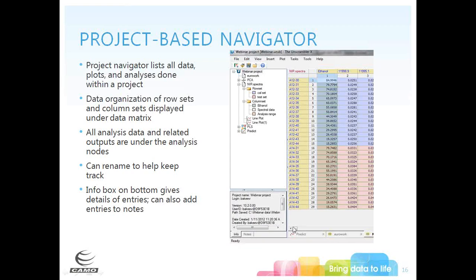There is an info box at the bottom of the navigator window, which shows the details of whatever item is highlighted in the project navigator — such as the project name, who's logged in, and when things were created or changed. You also have the ability, by going to the Notes tab, to enter your own notes regarding the project or matrices, serving as an electronic notebook.